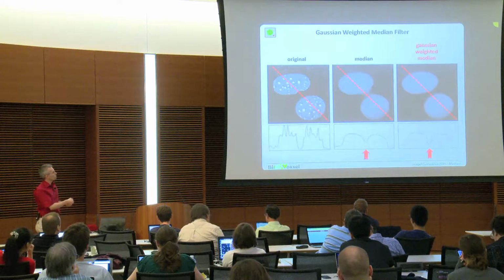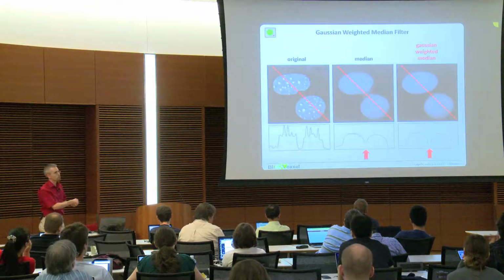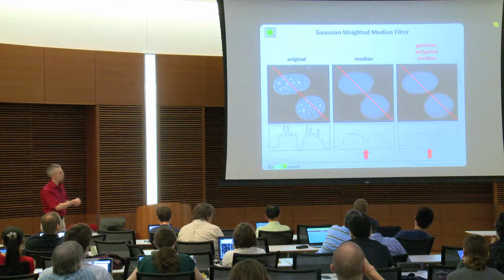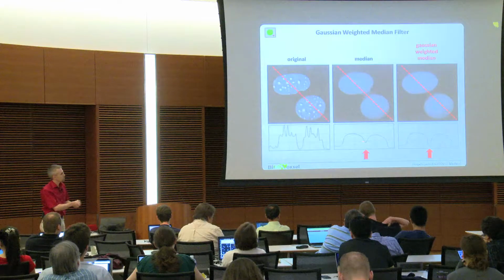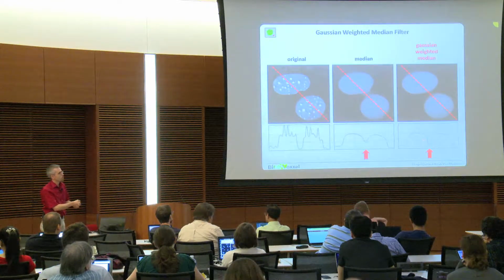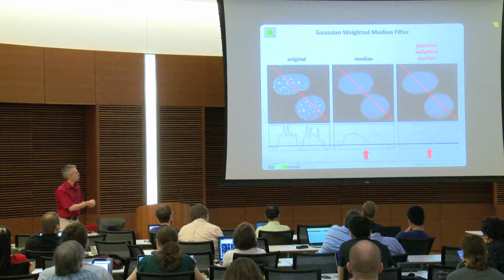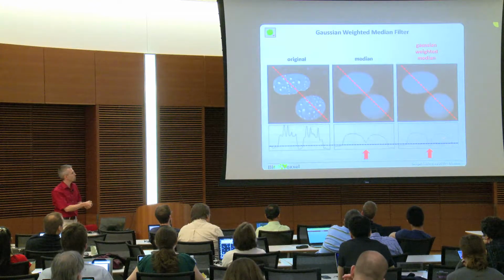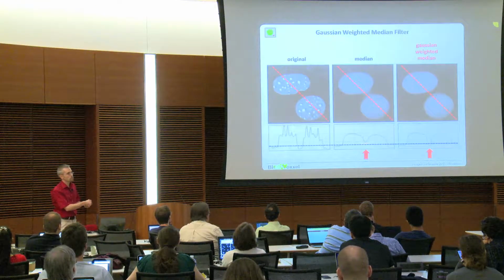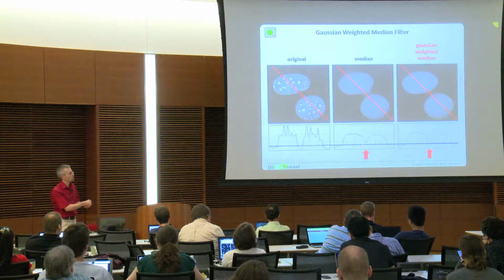If we make this dashed line and the line profile, you see that these peaks are actually eliminated. And the gap in between, which is necessary to separate those two objects. Now this is here a problem because this gap is here higher, and here you see it's still lower. So if we use such a cutoff value, then you see what actually was separated stays separated, so we will keep them separated after our extraction. Here it will be connected because our valley, the end of the valley, is actually still above our cutoff value.